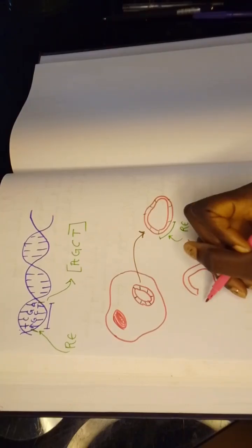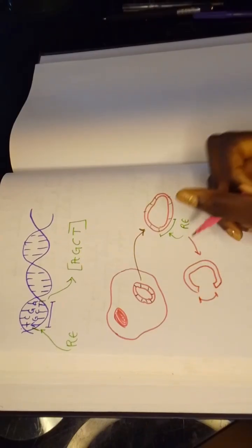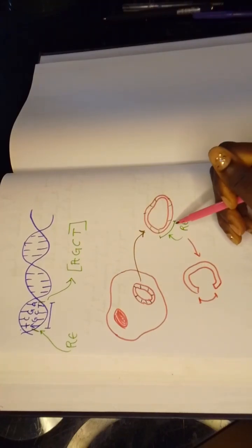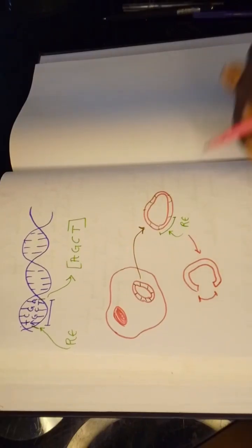Now this missing portion, our gene of interest would fit right into this position because the restriction enzyme has cut out a part of the plasmid where the gene of interest would be able to fit right into.